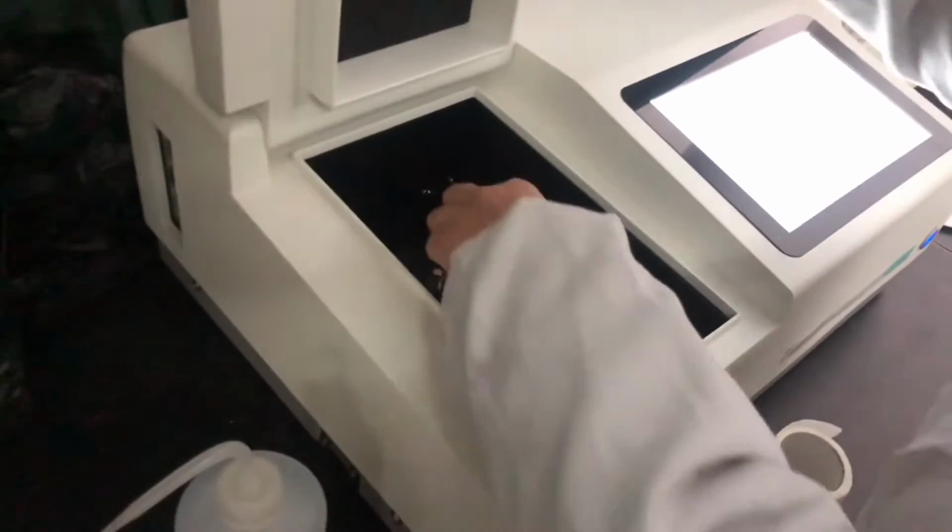If this sample is 0.0, it's okay. It's okay. Yes. We could do the last sample. Okay.